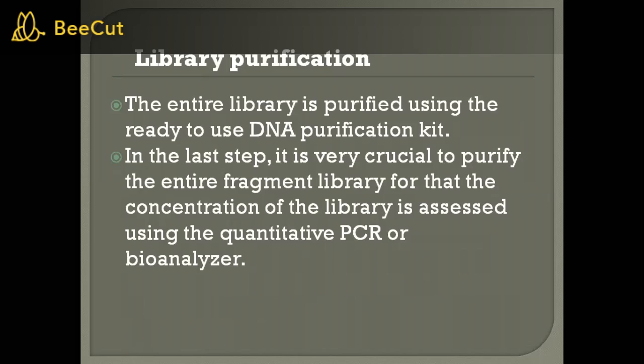So we have to purify that library, and after that we have to concentrate that particular library. It means we have to quantify that particular library. For this, quantitative PCR can be used, or we can also use the bioanalyzer.